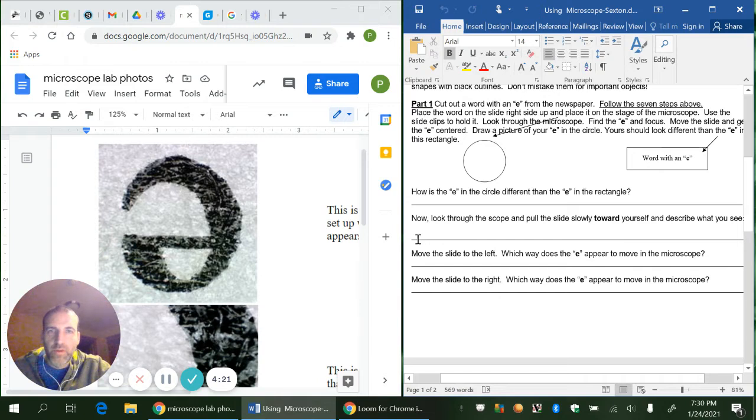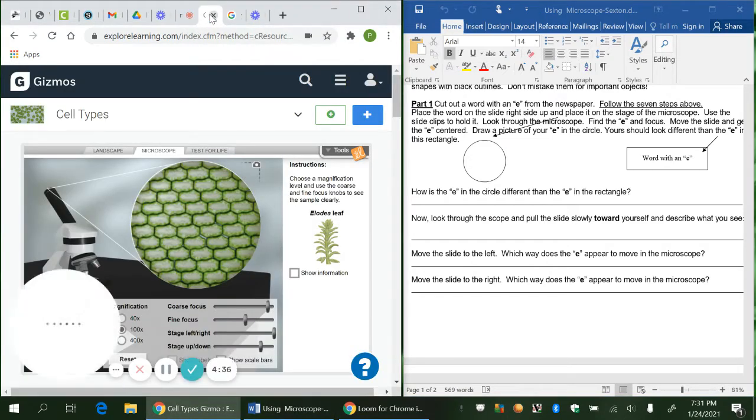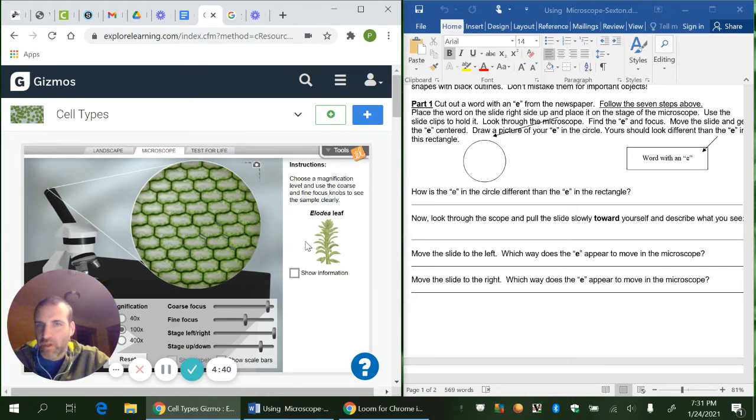Next, we need to look through the scope and pull the slide slowly toward yourself and describe what you see. So I'm going to jump over to the gizmo we looked at when we were learning about microscopes, and hopefully you'll be able to get a chance to see this a little bit better. So this item that we were looking at here is called Elodea. Elodea is a freshwater plant.